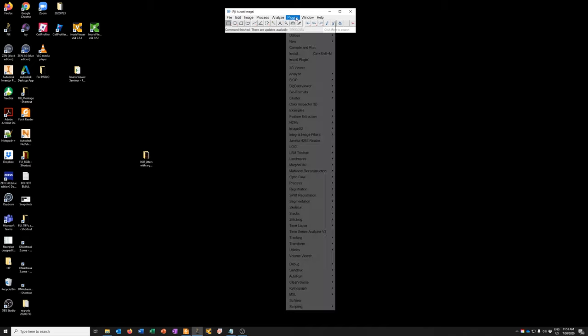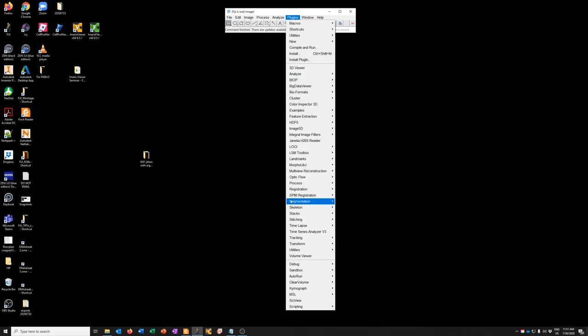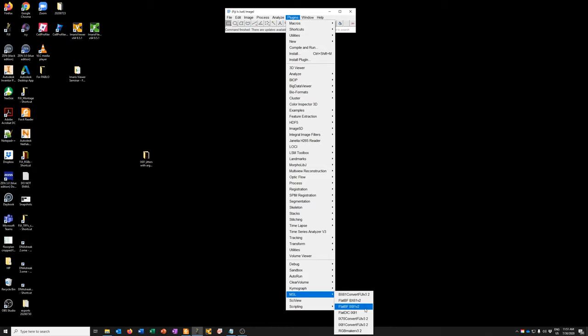So the way we're going to do that is we're going to go to Plugins, MSL, Flat, BF iX81 version 2. You can get these macros from our website in the resources page. They are already installed on the iX81 if you perform this stitching procedure there. They're also installed on our workstation.